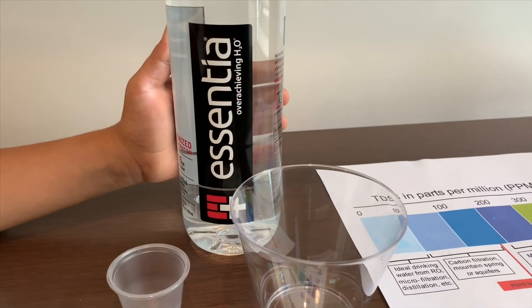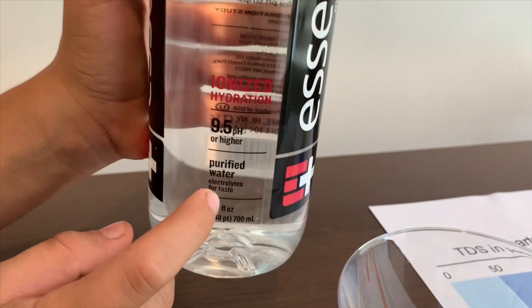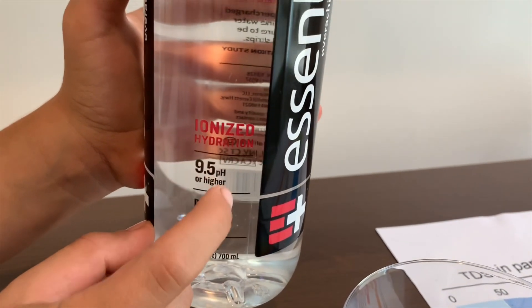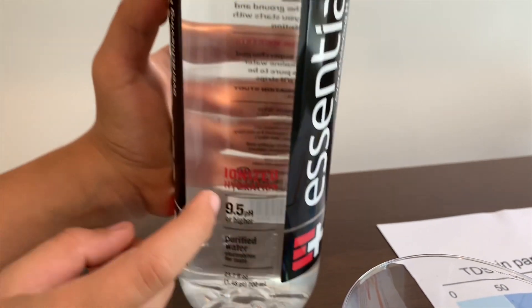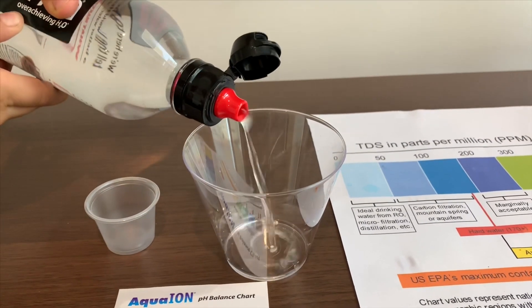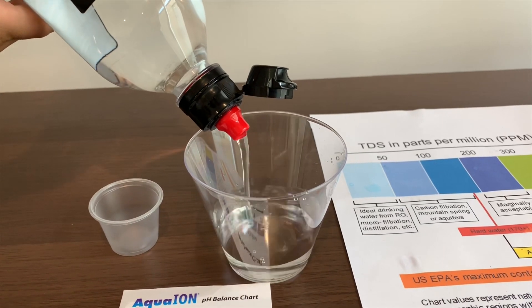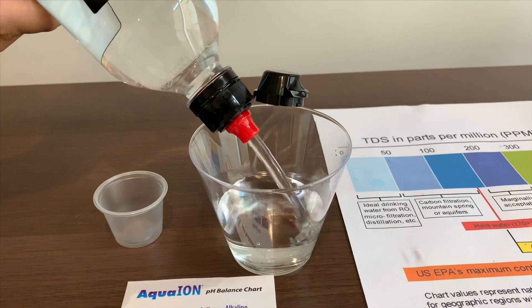This is Essentia purified water with electrolytes for taste. It's supposed to be 9.5 pH or higher. Let's pour some in and see. First, we're going to test the pH.